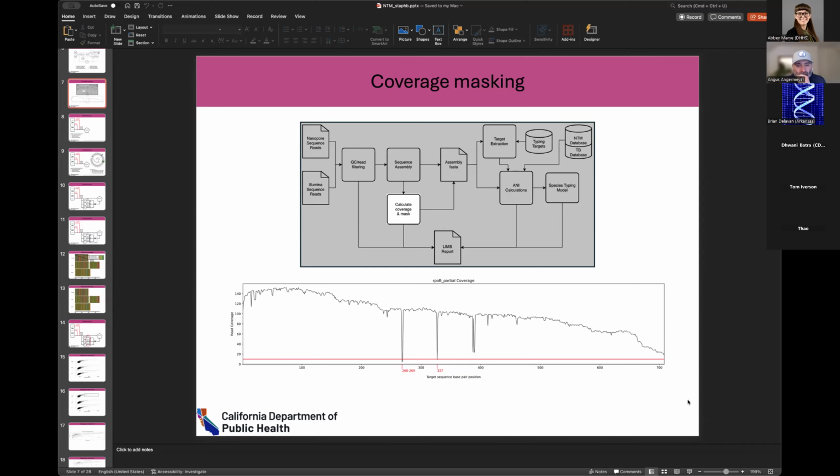If you're doing reference-based calling, it depends on your method, because if you were doing de novo, you would probably take all your reads and let the assembler make all those calls. But if you were just having these onesie twosie differences and you're doing it against a reference, then you usually say, to make a base call, you need at least this much read coverage, and then you go for majority or something like that.